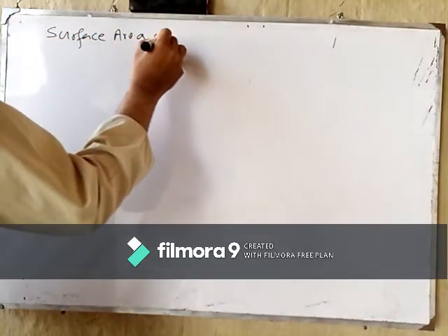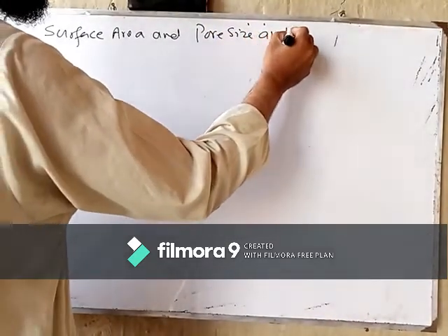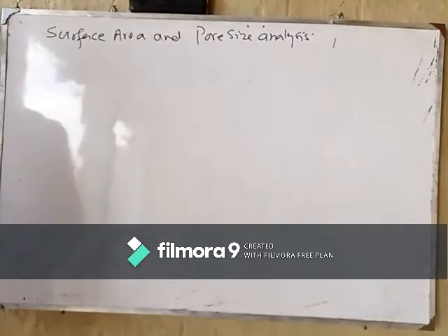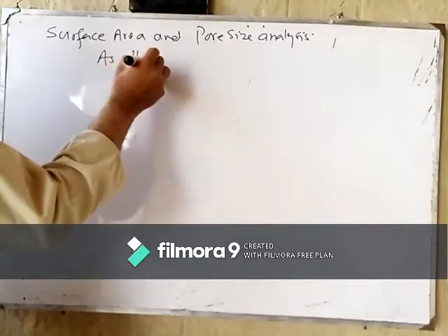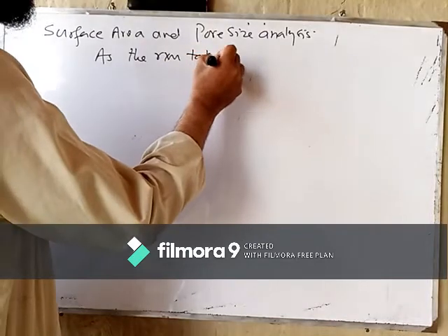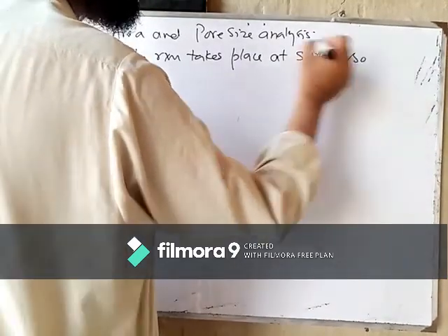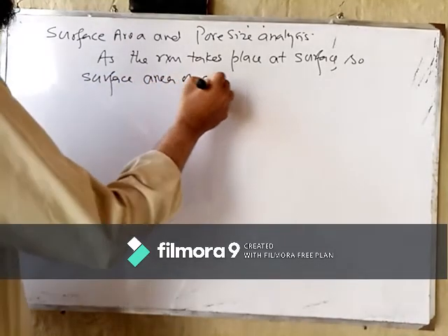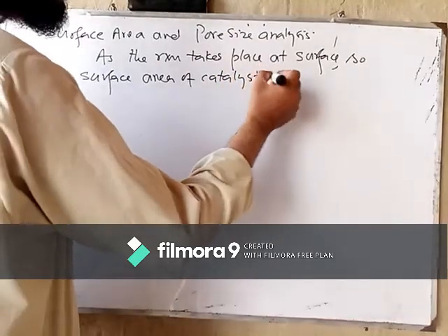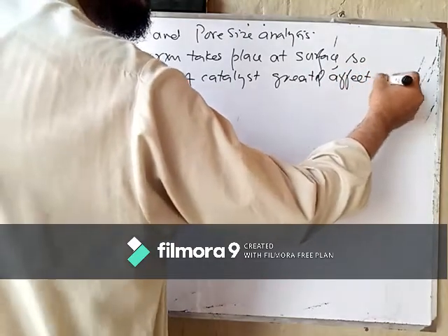Surface area and pore size analysis. As reaction takes place at the surface, so the surface area of the catalyst greatly affects the rate of reactions.